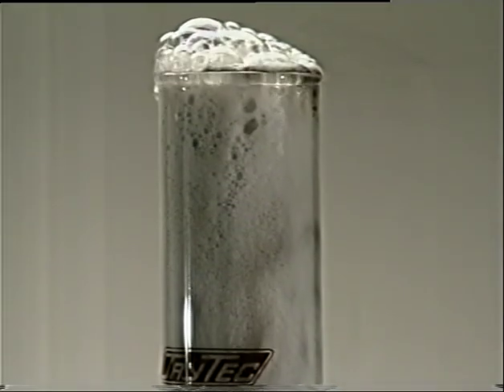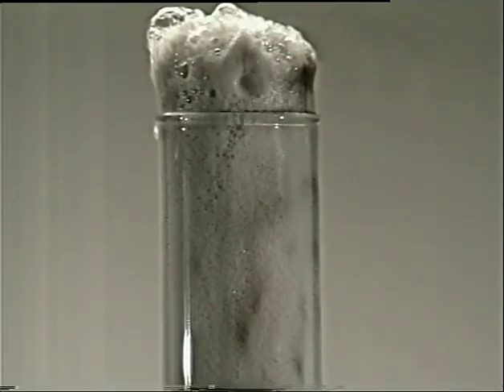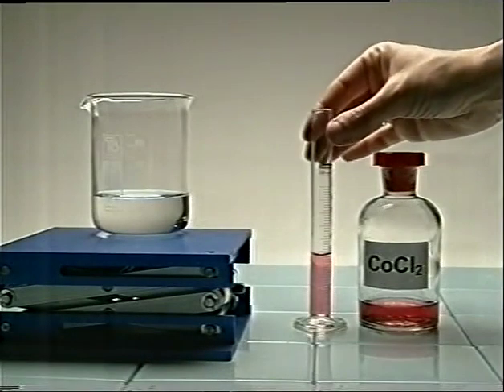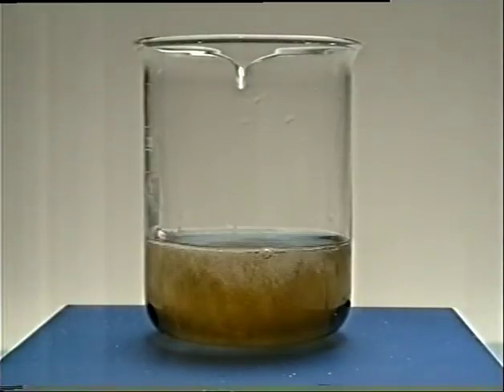Specific catalysts are used to speed up specific reactions. Cobalt chloride solution is the catalyst in this next reaction.